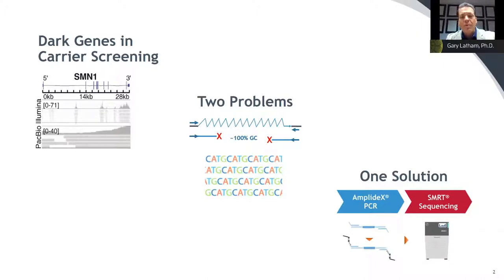Historically, I think what we've been missing is due at least in part to the streetlight effect, where the guy goes looking for his lost keys under the streetlight because, well, that's where the light is. Over the past several decades, the streetlight for genomic variation has included beacons of technologies such as high-density arrays and Sanger sequencing and next-generation sequencing, but the light they cast reaches only so far, and many structural variants with important and common disease consequences have been left in the dark. But that's rapidly changing, and that's what I want to talk about.